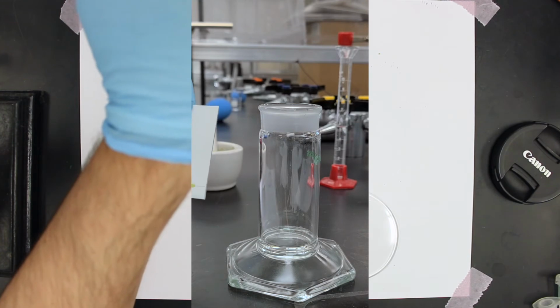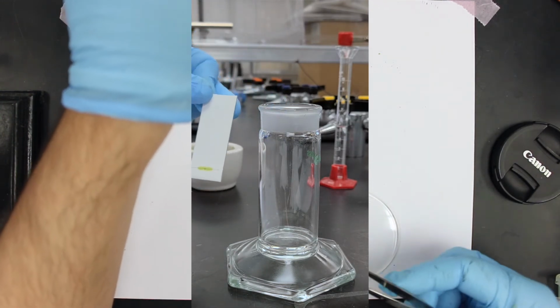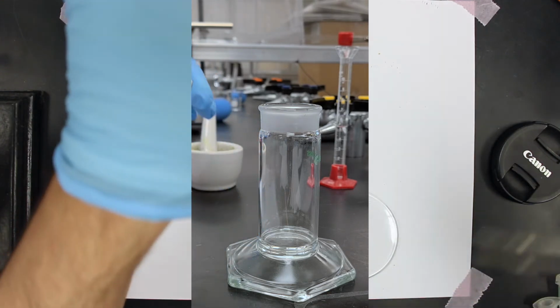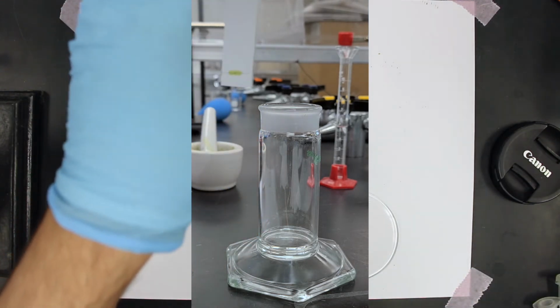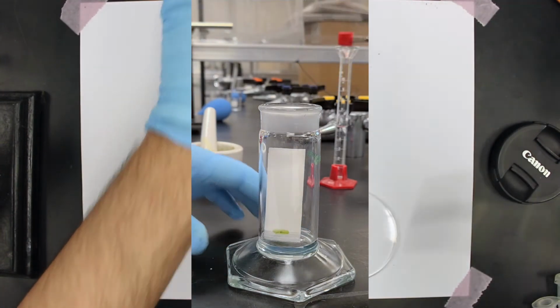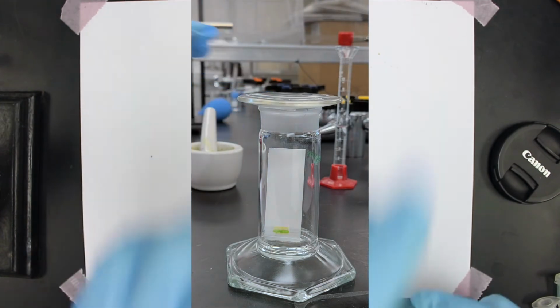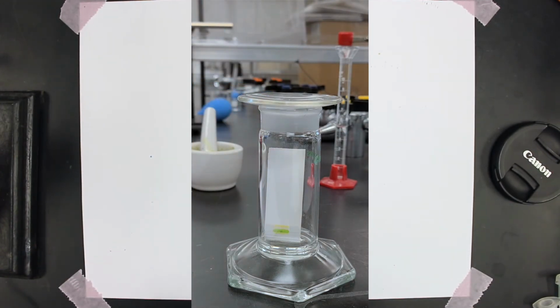So now that we've got our mixture here prepared, and we've got our TLC plate prepared, we can deposit it into the chamber with a pair of tweezers. So let's see if I can do it. There we go. Okay, and now we can cap it and simply wait for things to separate.